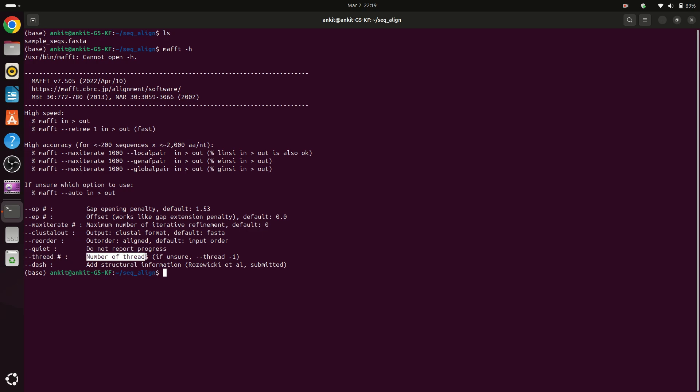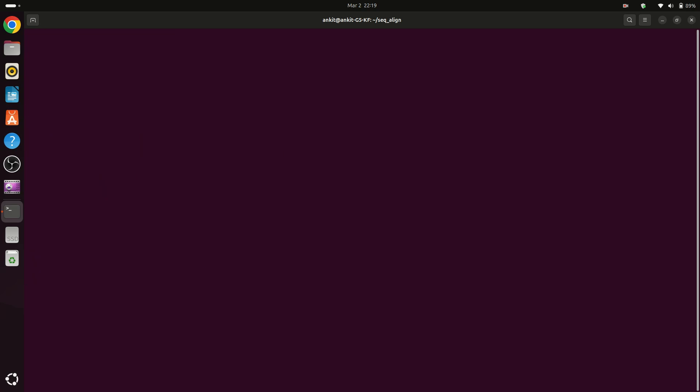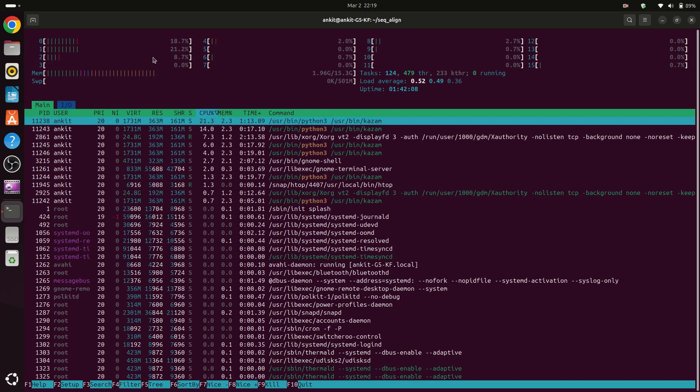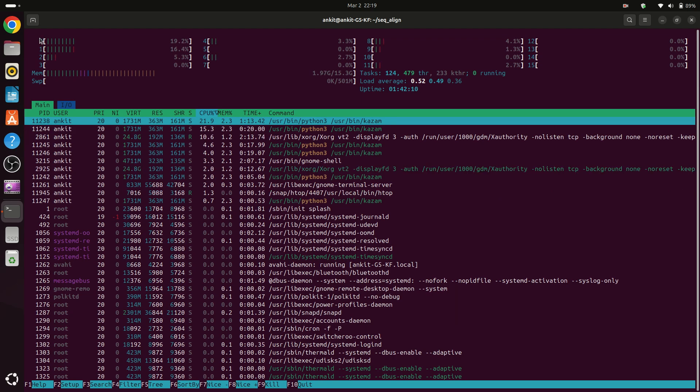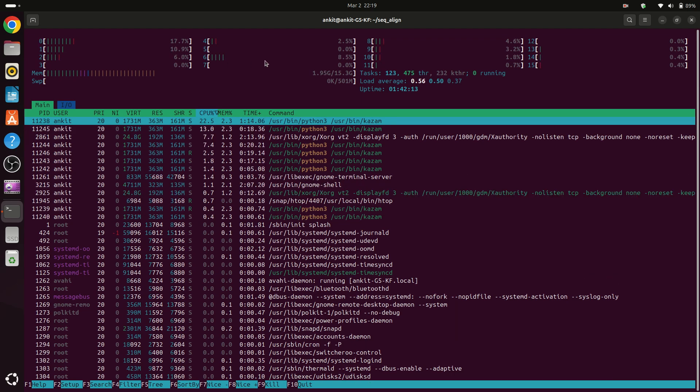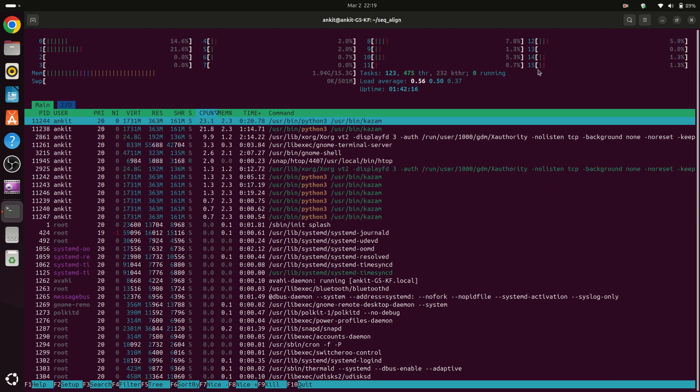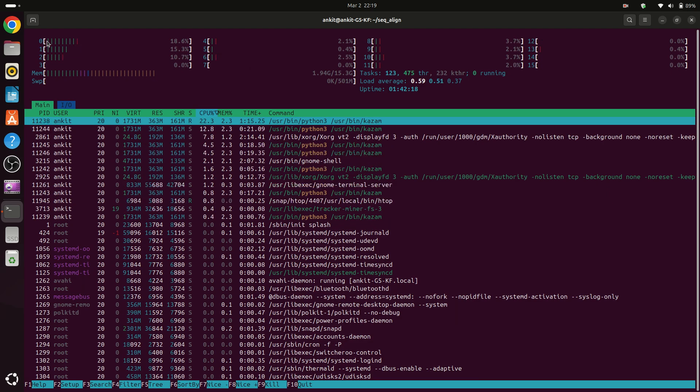For example, first you have to know that how many CPUs are in your computer. So you can type htop or install htop. Then you can see that from 0, 1, 2, 3, 4, 5, 6, 7 and so on that we have 15, but 15 plus 0 means we have 16 threads in the system. So we can give the threads option to increase the speed of our alignment.